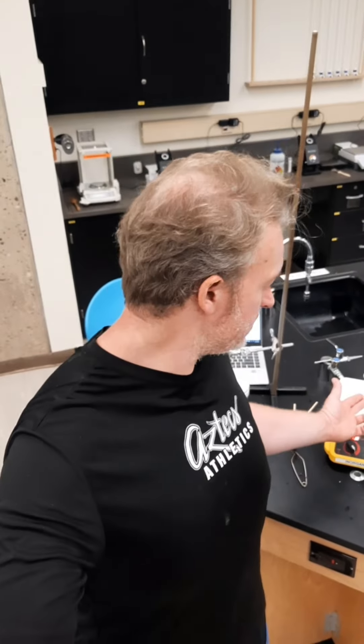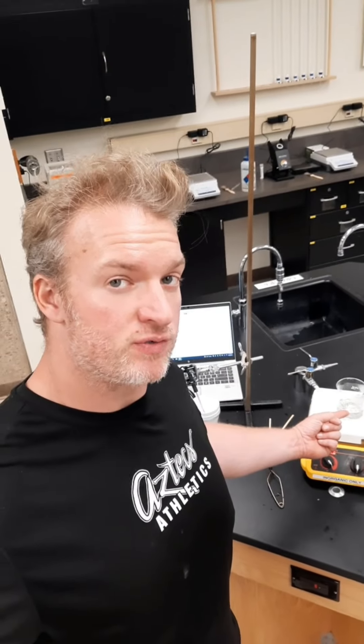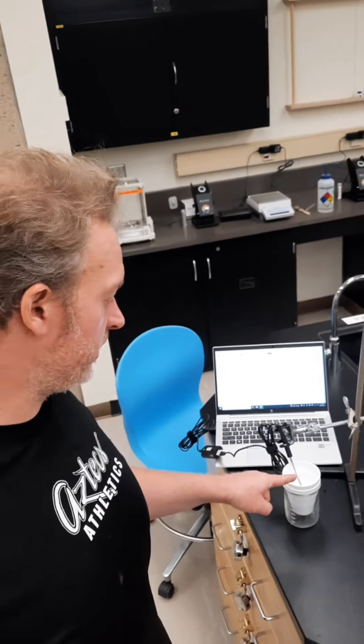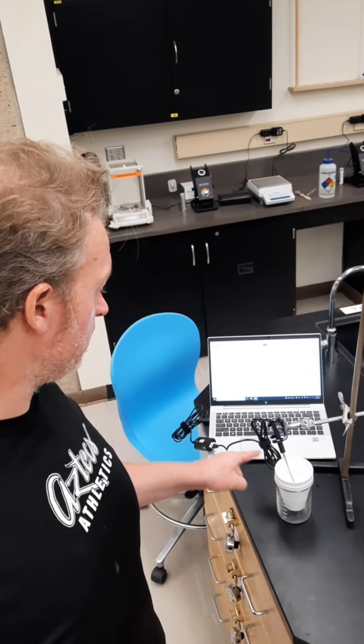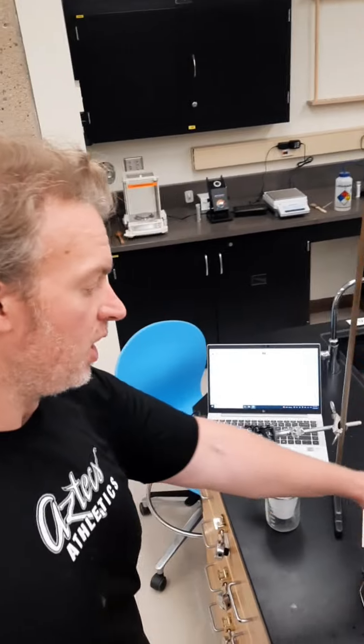Hello you absolute legends. This is to help you with the calorimetry lab, the second part where we experimentally determine the specific heat of a metal. Our metal is this hose fitting that is in boiling water. So we know the hose fitting is starting off at 100 degrees Celsius. We're going to put the hose fitting in this water and this water is currently at 22.9 degrees Celsius. We expect this water to increase in temperature when we put in the hot piece of metal.